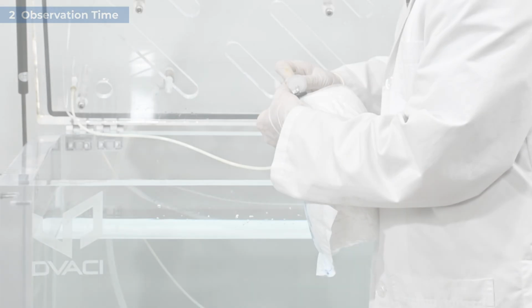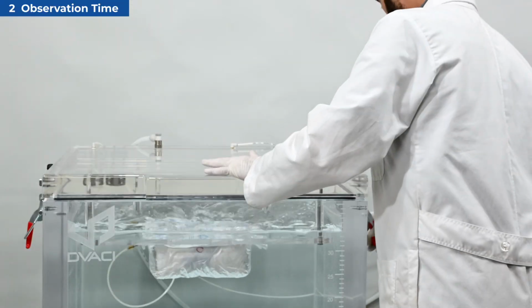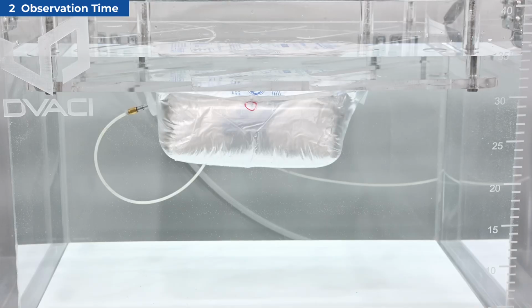Once the test pressure has been defined, the next step is to establish the observation time using the control sample as the minimum reference. If the control sample reveals a leak in 2 minutes, you cannot conclude that a package is intact by observing it for less than that time. The observation time must be equal to or greater than the time at which the leak appears under the selected conditions.